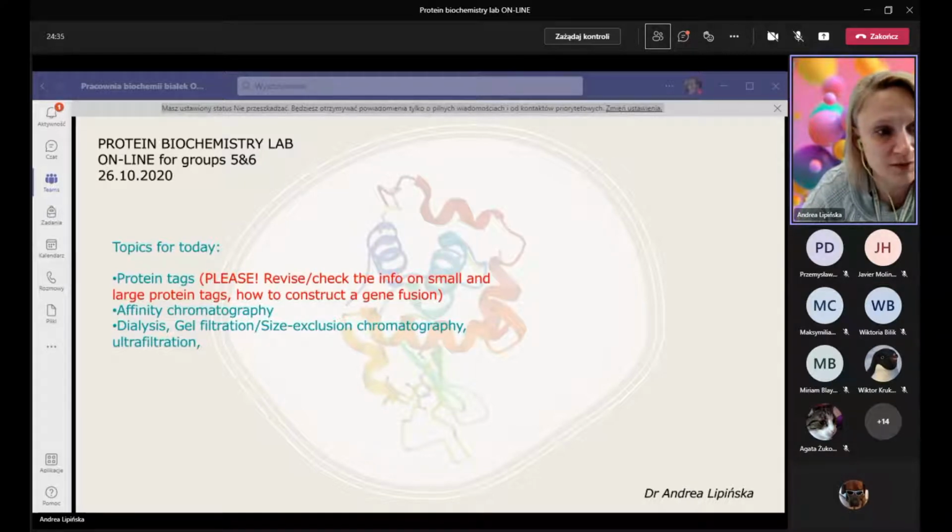Sometimes in between the GST sequence and your target protein, there are also different kinds of linkers, apart from those protease recognition site encoding sequences. Because it may happen when we have fusion proteins, like tag proteins, that the tag itself interferes with the folding of your protein. So in order to ensure proper folding, we separate the tag and our protein of interest by means of a linker. And there are two types of linkers which can be used.